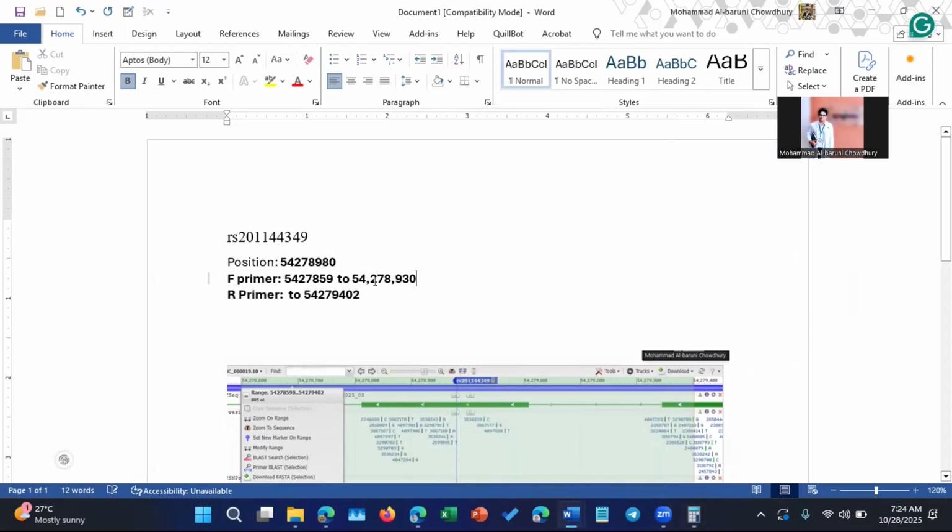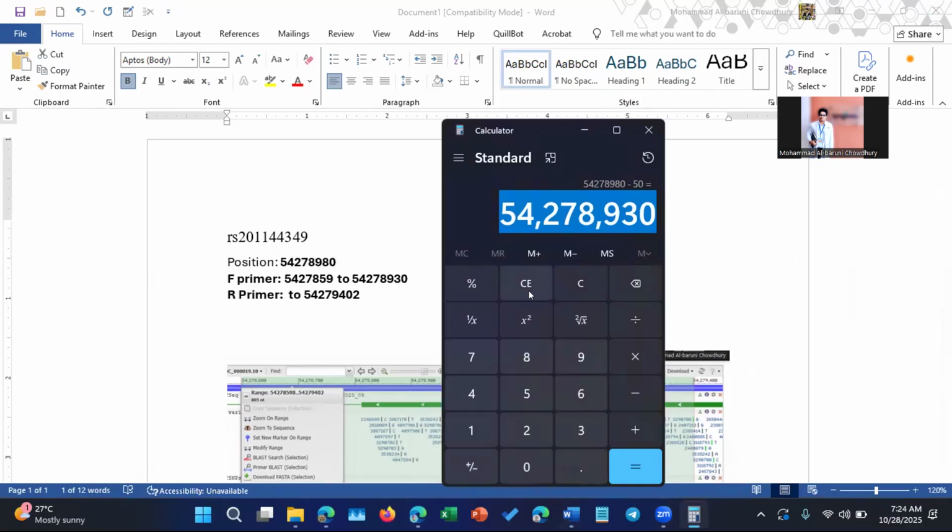Replacing the things and make sure that there is no comma because the server cannot read the comma. Then 50 will be ahead of this position. So I'm taking this again. Just check every time because this step is sensitive. Then at 50, if this step is not done properly, you will encounter many error messages.